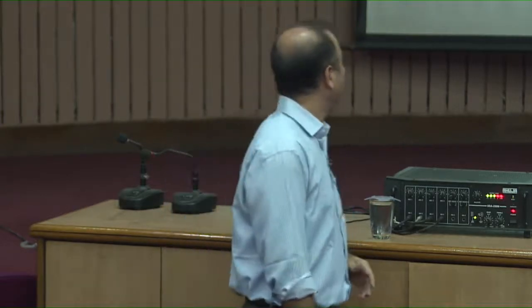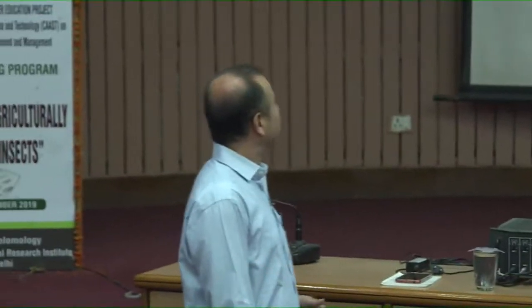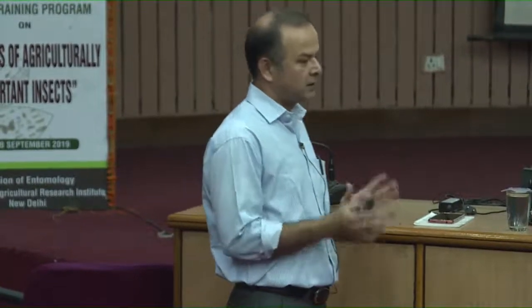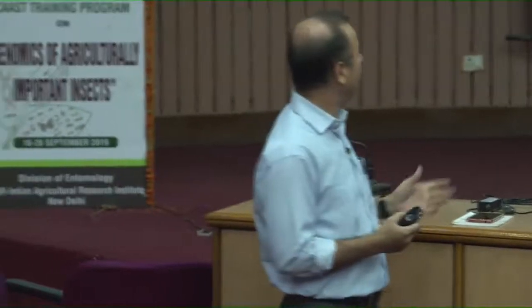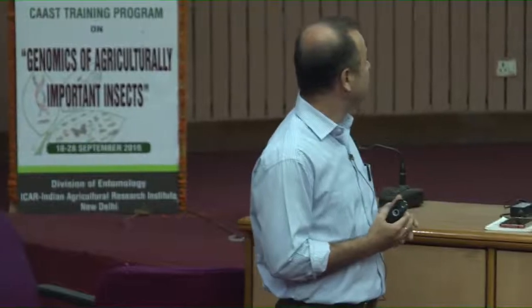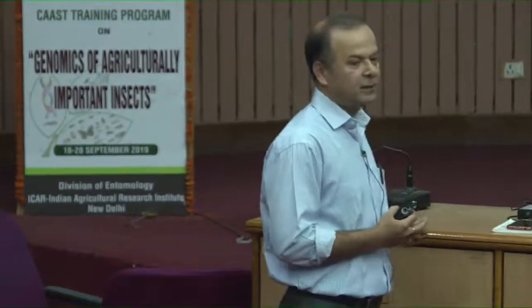So, today our topic is about gene expression analysis, and particularly how do you normalize. There is a process called normalization in gene expression analysis that I will come into detail. It is the use of housekeeping genes in the normalization process while doing the gene expression analysis.